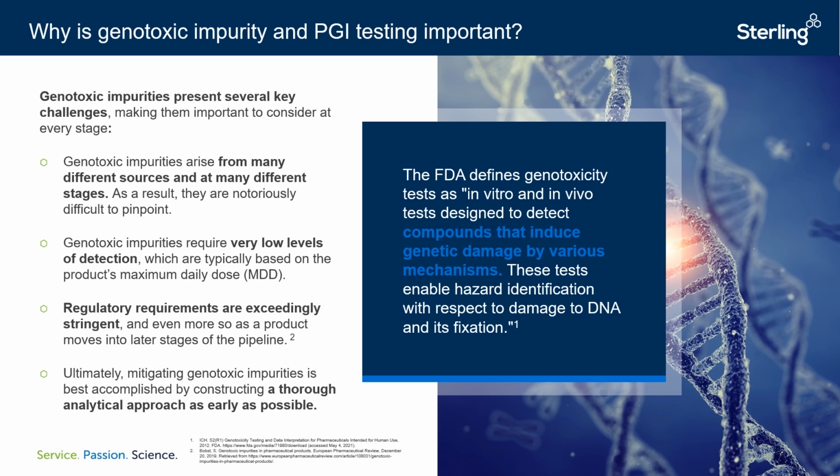They also require very low levels of detection, typically based on the product's maximum daily dose. Next, regulatory requirements become more stringent as a product moves into later stages and nears commercial approval. This is another reason that it is so important to remain on top of PGI testing through each stage of development and manufacturing.